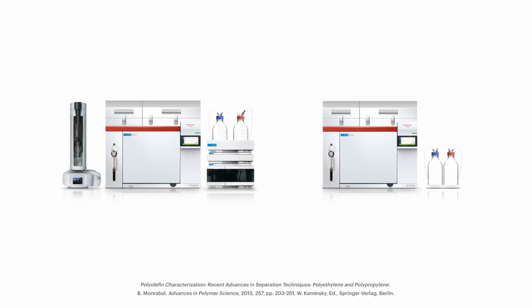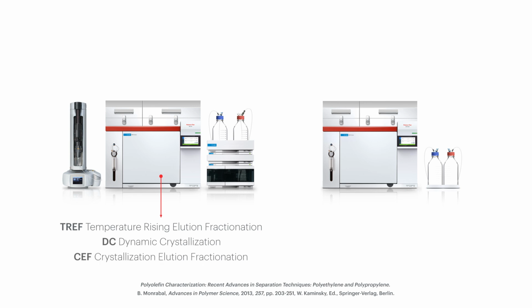The separation techniques according to crystallizability are TREF, temperature rising elution fractionation; DC, dynamic crystallization; CEF, crystallization elution fractionation; and CRYSTAF, crystallization analysis fractionation.